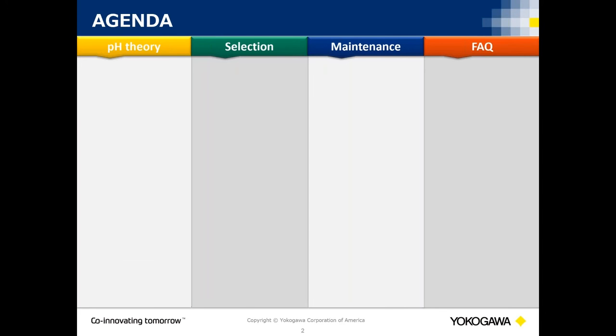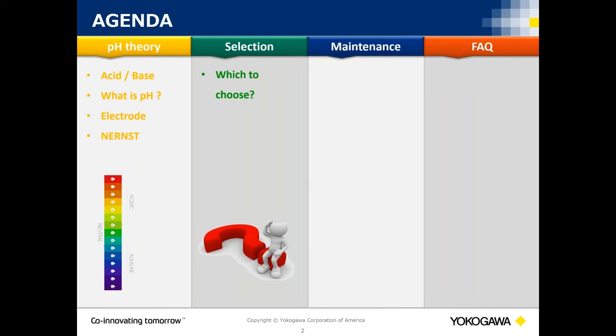He gave you the basic theory behind pH. So we're going to go into that in a little more detail and then talk about how the actual pH electrode is physically working itself.